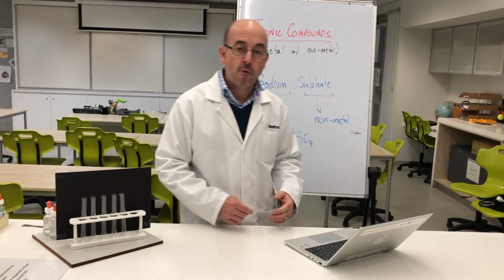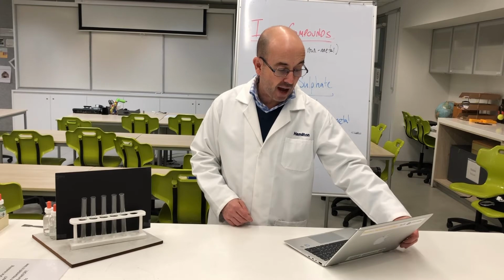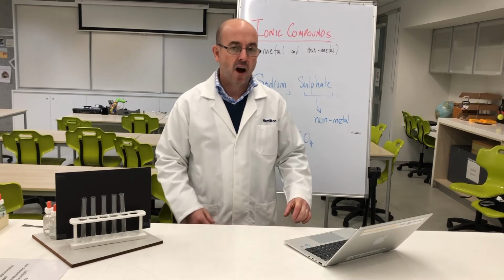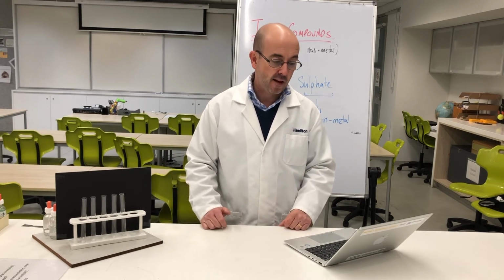Once again, I'm going to perform these experiments on some known substances, which you can find on page 9. We're going to test 5 knowns. And then we'll come back and we'll test 5 unknowns to determine whether we think that they are or they are not sulfates.